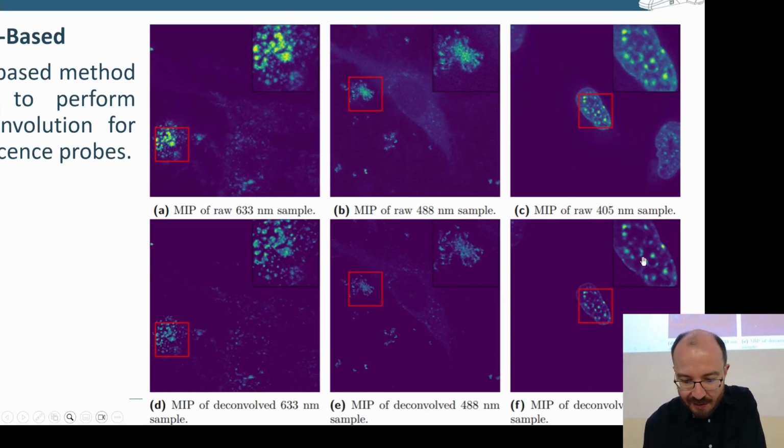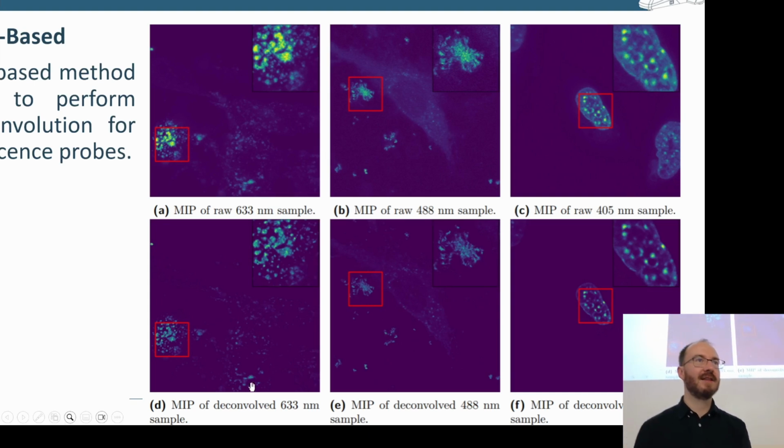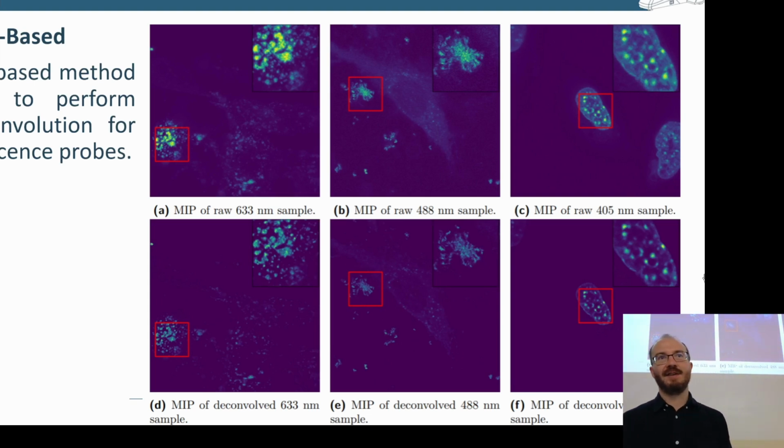The big question now is, am I going to trust it? And am I going to trust it on different data? That's another question. So what we did was train it on one wavelength of light and see how it generalizes to other wavelengths of light. We found that it works generally well. But if you train it on all 3 wavelengths of light that we wanted to test on, then it definitely performs better. So a rule of thumb, if you want to go the neural network approach, is that what you train it on is where it performs well. What you don't train it on, it's a little bit of a guess whether it will work or not.